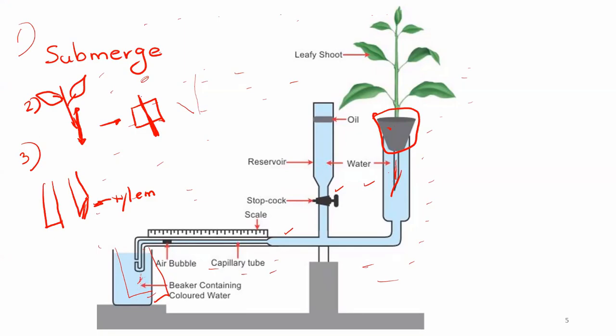understood? Yes, ma'am. Then after, slightly we can uplift this capillary tube to expose it to the environment and allow only one air bubble into this capillary tube.